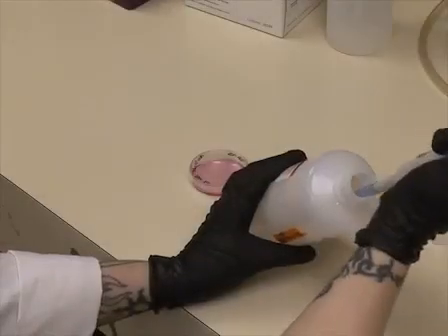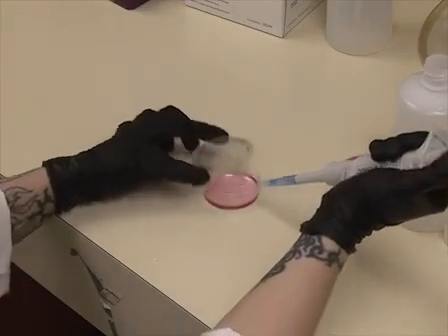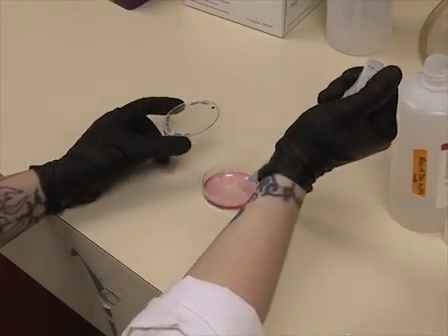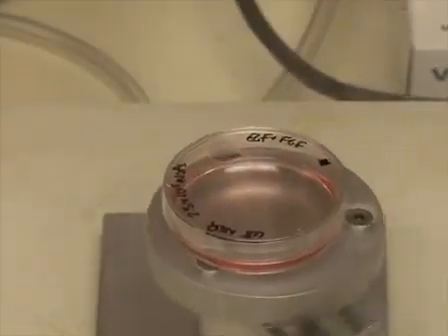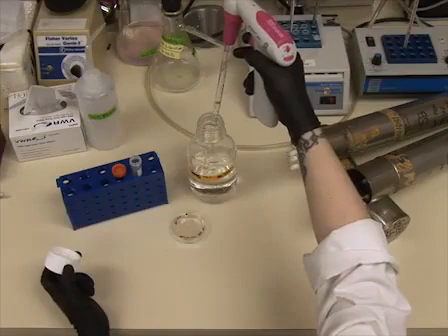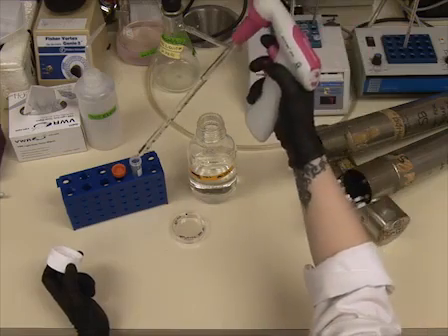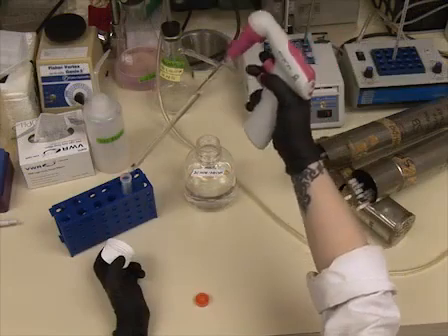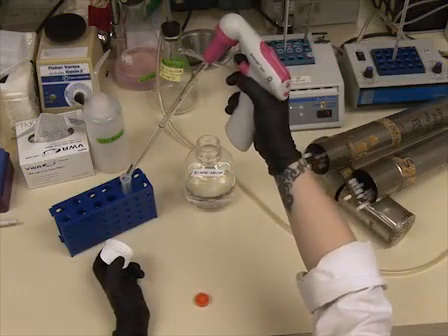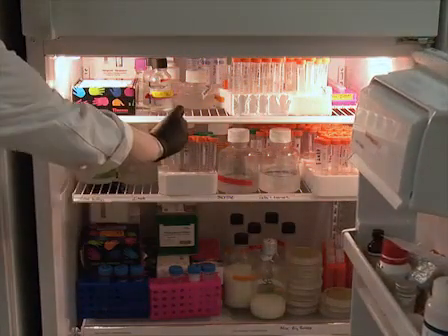On day in vitro 14, fix the neurospheres using formaldehyde to a final concentration of about 4% by adding it directly to the culture and incubating at room temperature for 20 minutes with rocking. Pellet the cells by centrifuging at 300 times G for 5 minutes. Wash the cells twice with PBS and resuspend in a 15 to 20% sucrose solution made up in 10 millimolar phosphate buffer. Leave to cryoprotect at 4 degrees for at least 24 hours prior to sectioning on a cryostat.